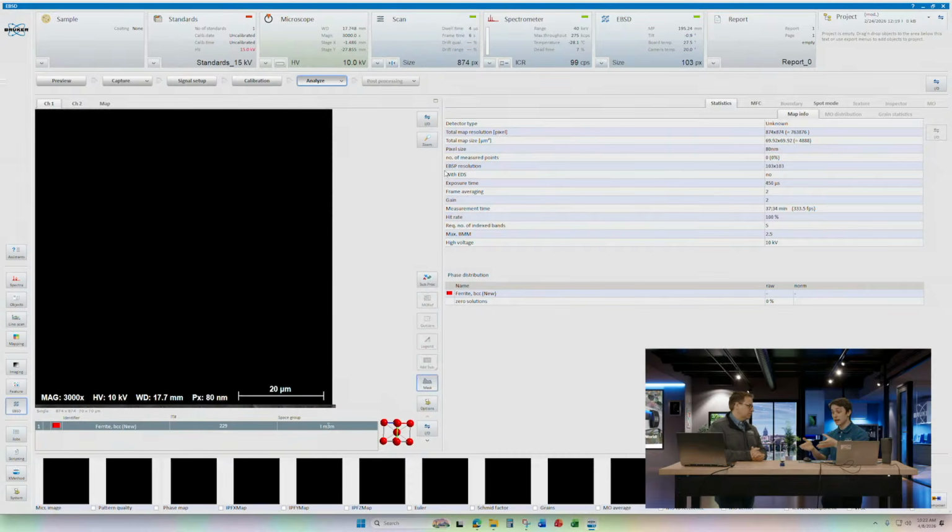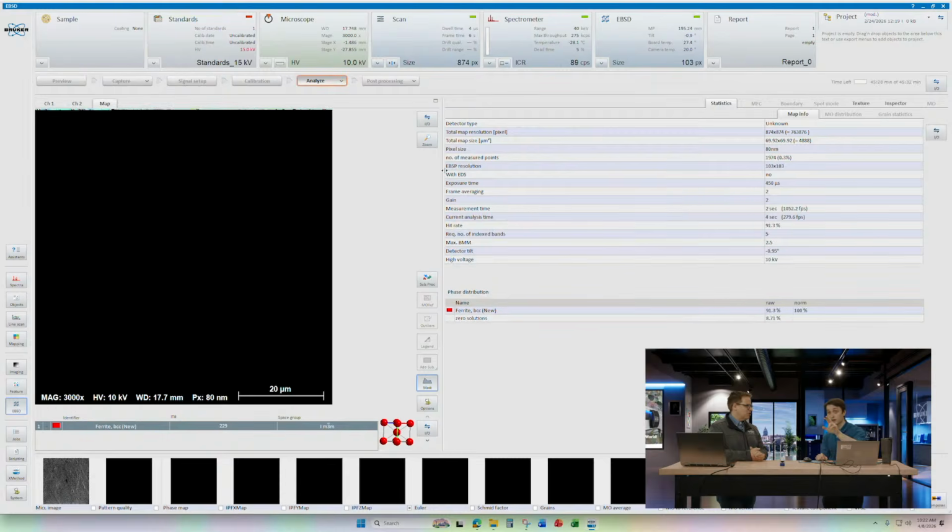The sample that we have here today is a Widmanstätten pattern meteorite. And Widmanstätten, yes. Okay. Yeah. I clicked acquire there, so we're getting our first lines of data coming in as we're chatting here. All right. And so the image that we first saw, that was the electron beam image? Correct, yeah. All right. So that'd be like the normal one.